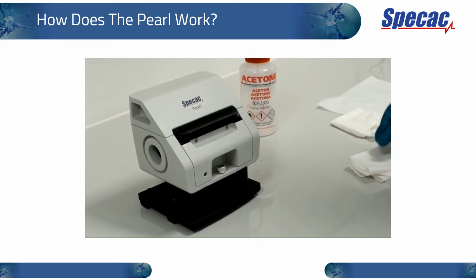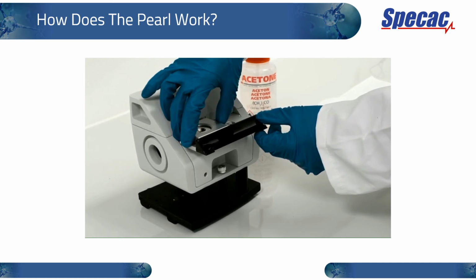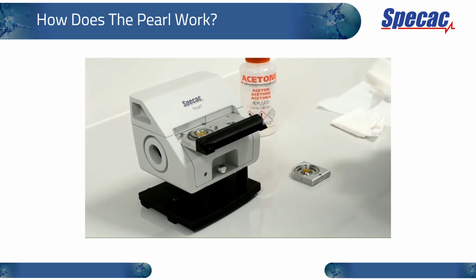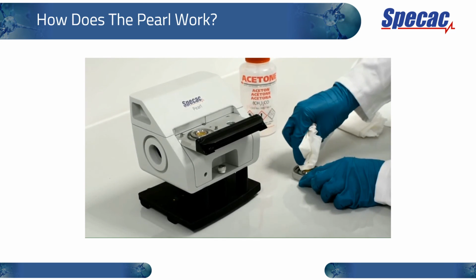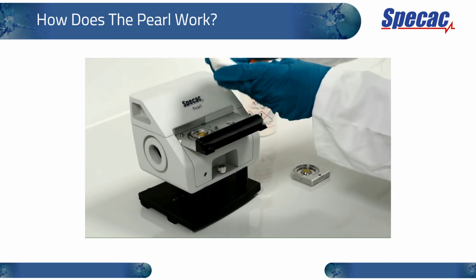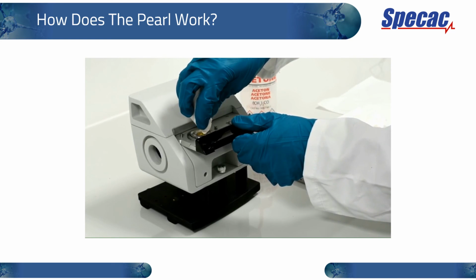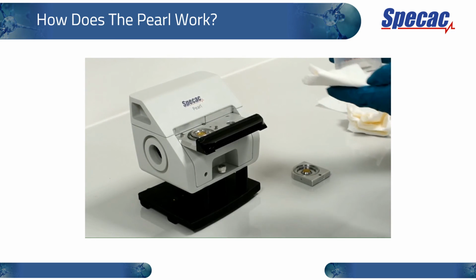When your measurement is done, open the drawer and then take the top window out. You can then wipe away your sample with a tissue and then wipe clean with some lens tissue soaked in a suitable cleaning solvent.